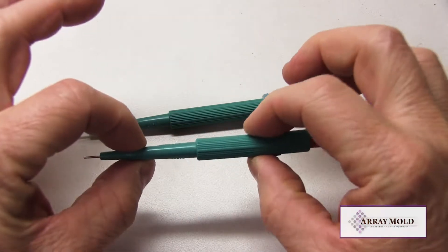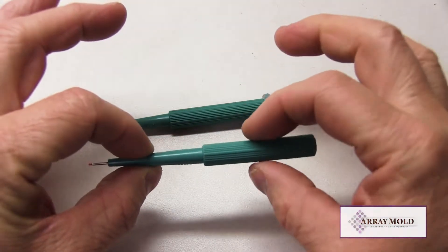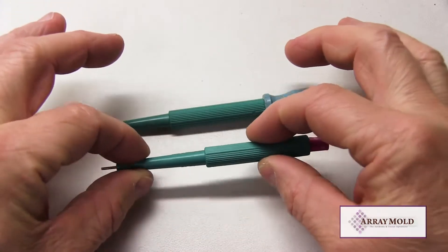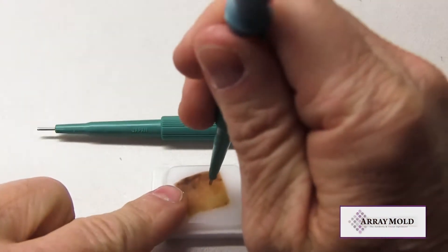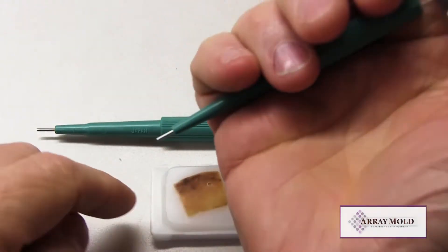Other TMA instrument companies currently on the market either use this plunger type needle or a custom needle. Let's show an example of these two needles punching and extracting tissue samples.